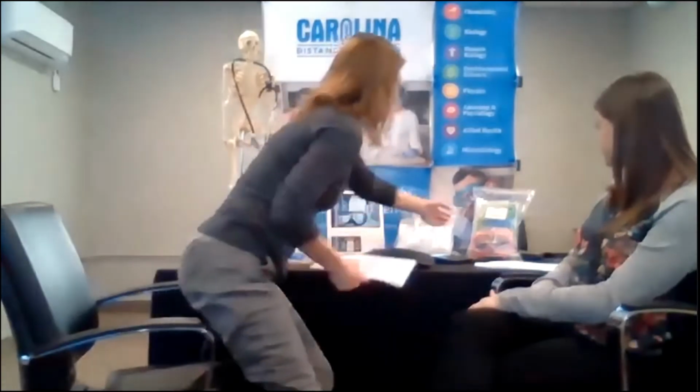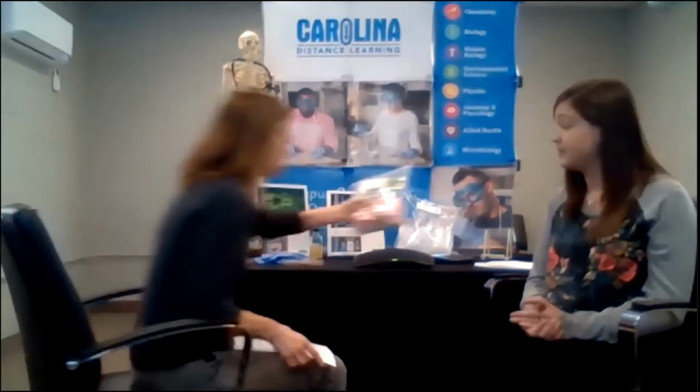So one thing I did want to point out, because we've had some questions about it, when a student gets a box in the mail, how do they know which investigation they're going to do? How do they know what the equipment is? And for example, on the safety set, you'll notice it has a label. All of the investigations come like this. They're packaged together and they are very well labeled. So when a student opens the box, they know what each component in that box is. They know exactly what lab they need to get. Perfect.